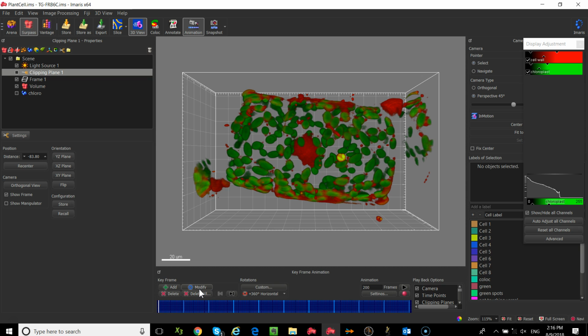Quick question. Yes. So I have a scale bar and a color bar, but there's no labeling. I'm curious, it's 20 microns. Mm-hmm. How do I get a label on mine? Okay. So we're talking about this little label. So this is a scale bar down at the bottom. I'm going to move it so people can see it. You need to be in select mode to move it.